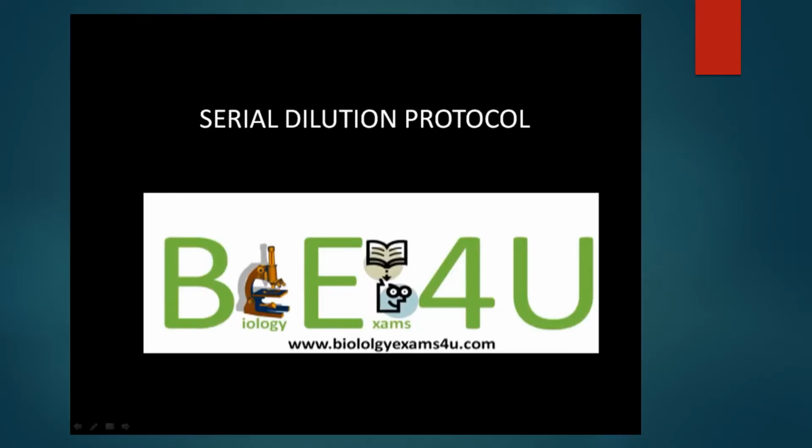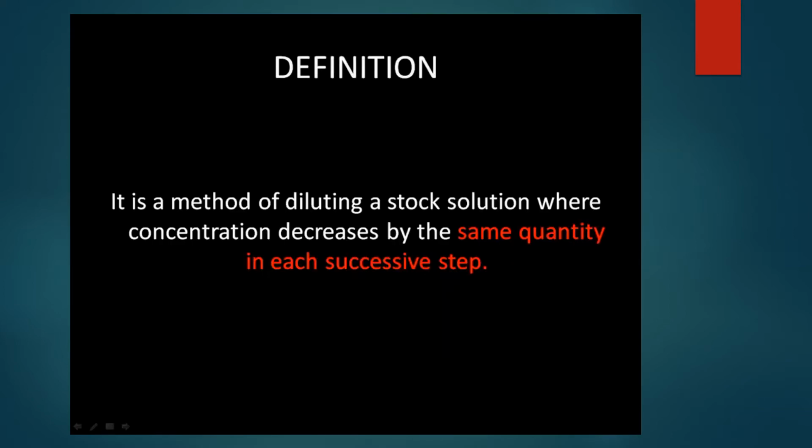Hi friends, in this tutorial we are going to discuss the serial dilution procedure in detail. It's a method of diluting a stock solution where concentration decreases by the same quantity in each step. And this is key: the decrease in concentration is the same quantity in each successive step.